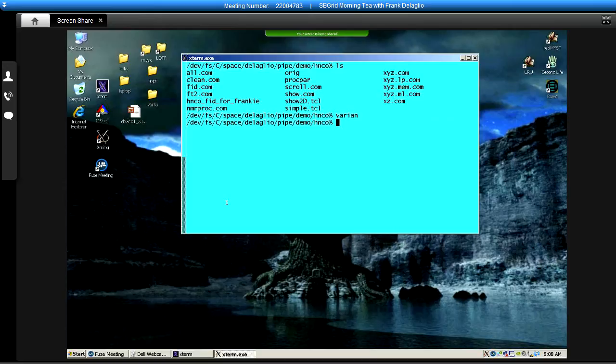Thanks very much for the extra privilege of being able to address the SB Grid community 2 weeks in a row. Last week, we talked about some general details of signal processing. Today, we'll see how things work under the hood in the NMRPipe system.